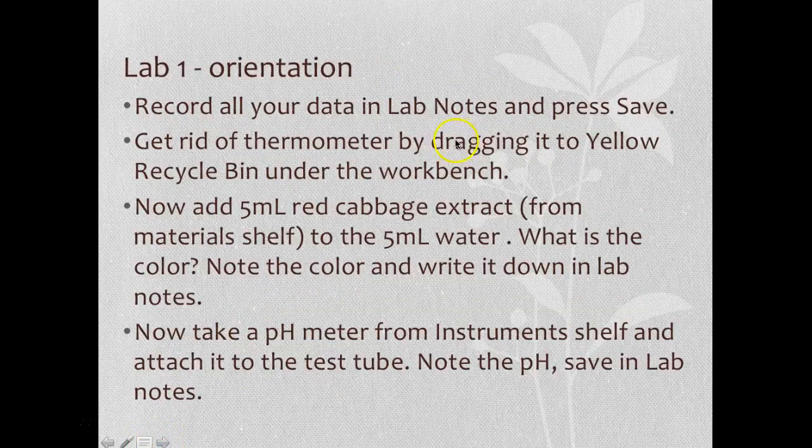So make sure as you're writing down your notes in the lab notes tab that you're pressing save frequently, all right? Another suggestion that I would like you to incorporate is to make sure that you write those exact same notes on a notepad as you go along, just as a precautionary measure. Okay. Anytime you want to get rid of things, just drag it to the recycle bin or press on that button that says clear the bench.